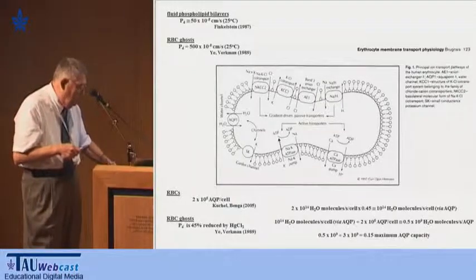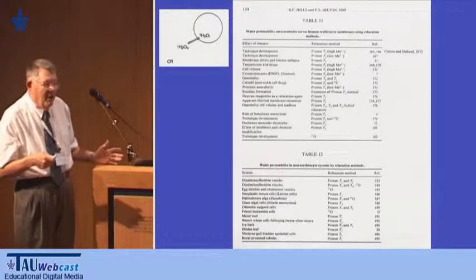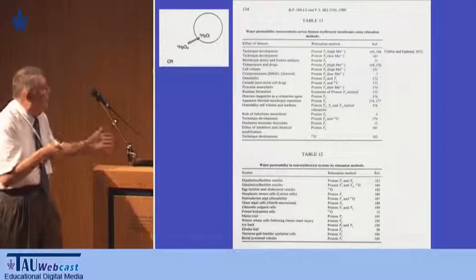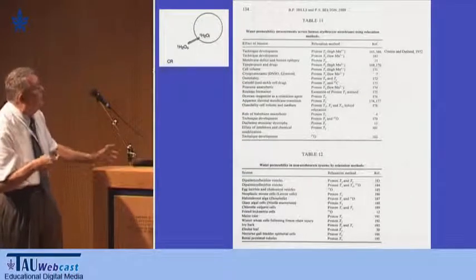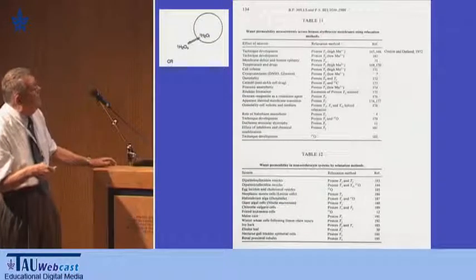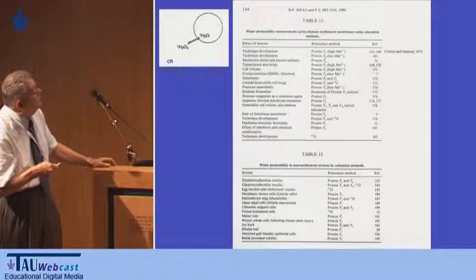And I'm going to give you a hint as to what that might be. Well, almost at the same time, NMR people, I know you can't read this slide, have been studying equilibrium water exchange for many years. This is a review article from 1989, 20 years ago, which really started with Conlon and Outhred in 1972.